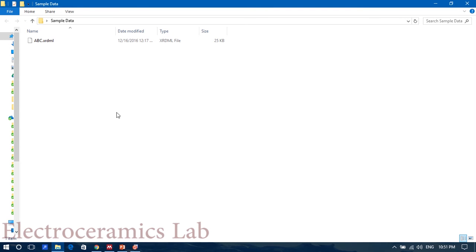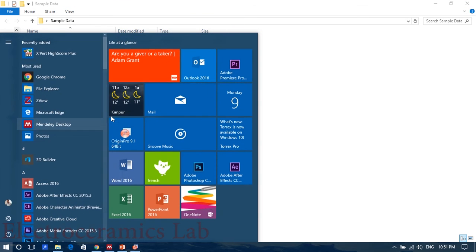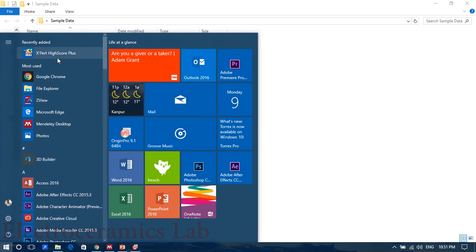Here I have a sample XRD data of a sample. For security, I've written its name ABC. So let's open it in Expert HighScore. Here is the Expert HighScore.